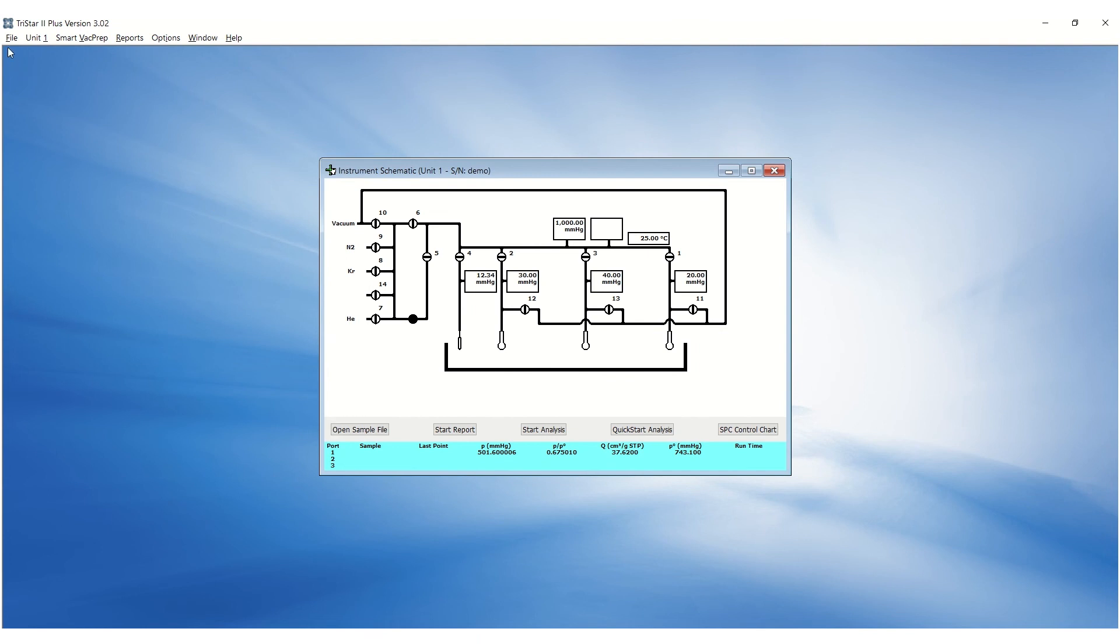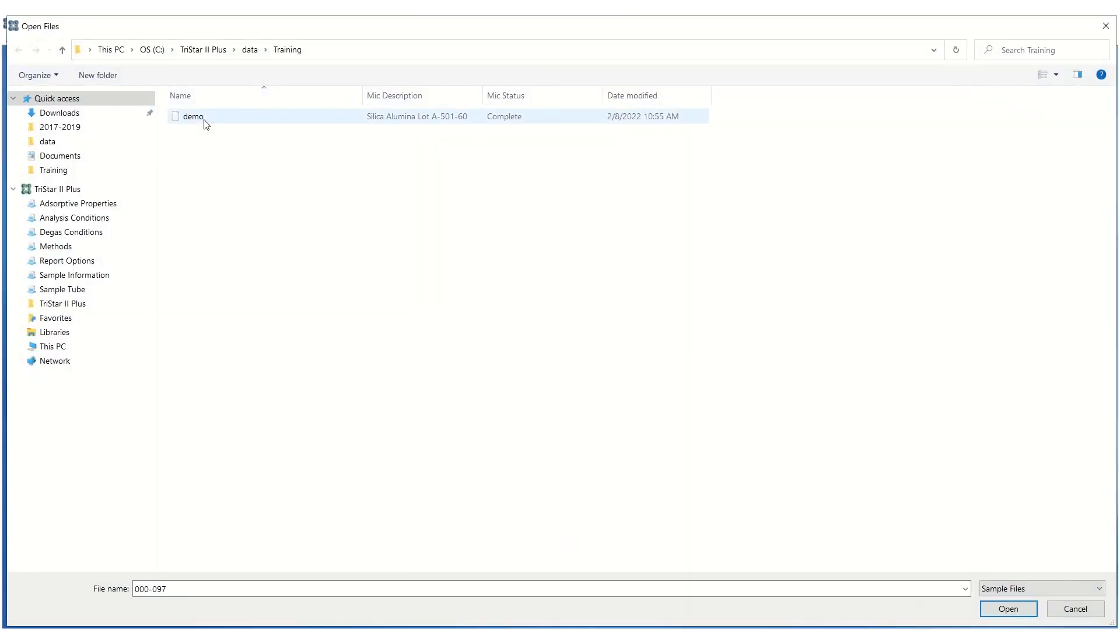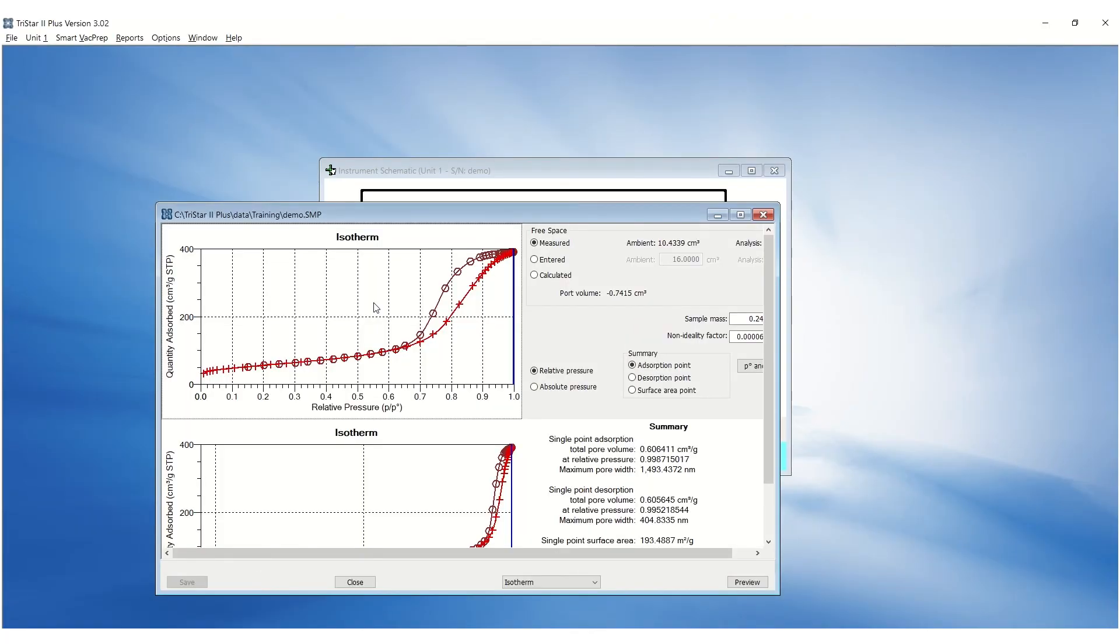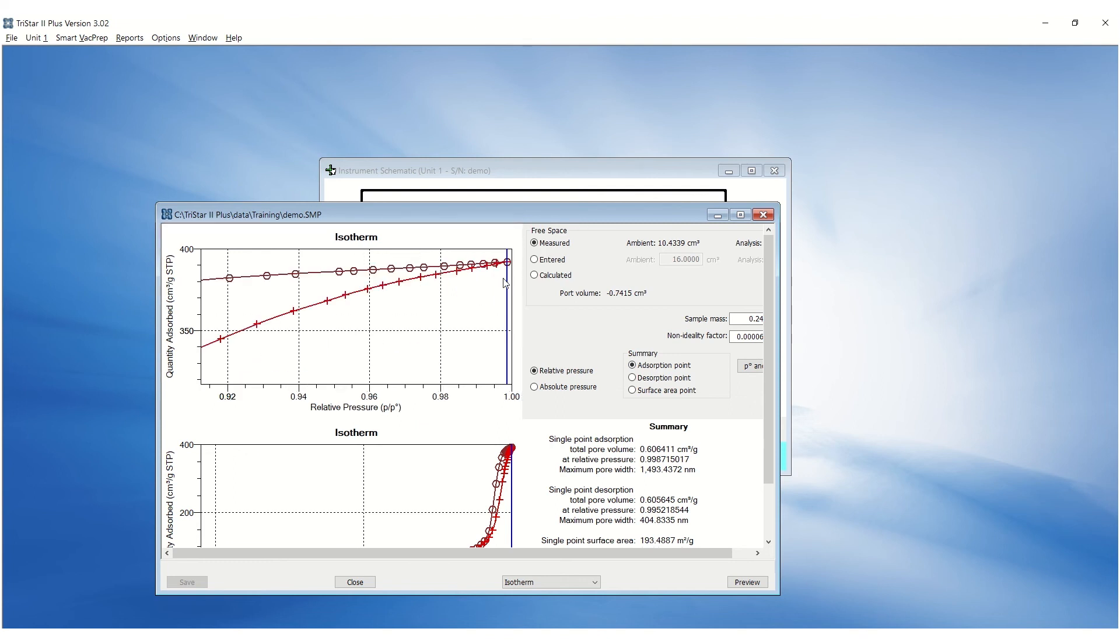Once the analysis is complete, go to File, Open and open the sample file. For the Silica Alumina, the total pore volume for adsorption and desorption can be changed by selecting adsorption point or desorption point and adjusting the blue bar. Adjust the adsorption point to the highest adsorption point pressure and the desorption point to the second highest desorption point pressure.